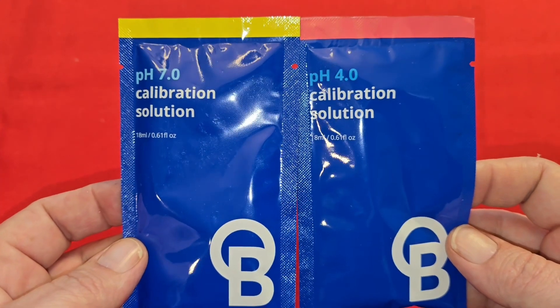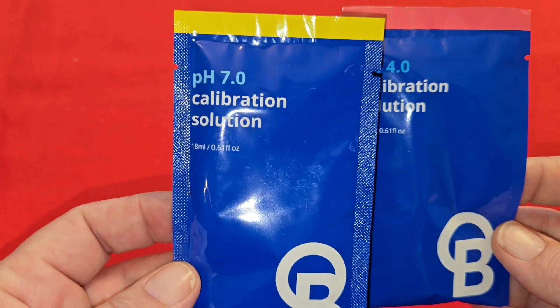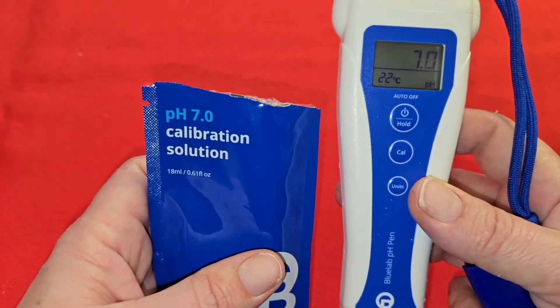After 24 hours of soaking in the KCl storage solution, you're going to want to calibrate your meter first to 7 and then to 4. I'm going to show you how to do that now. Let's start off by calibrating to 7.